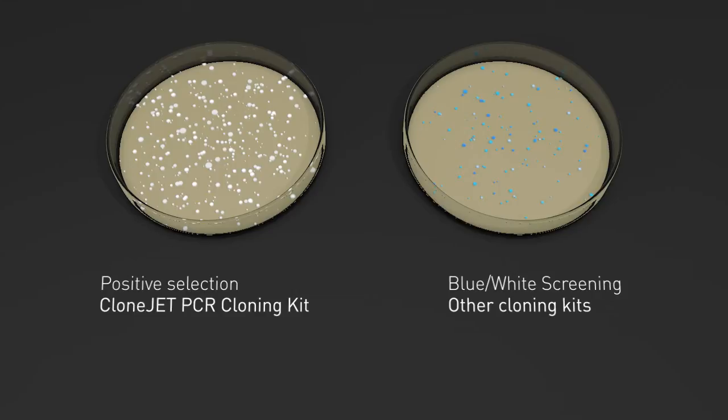With this technology, the CloneJet PCR Cloning Kit is capable of generating more than 99% recombinant clones.